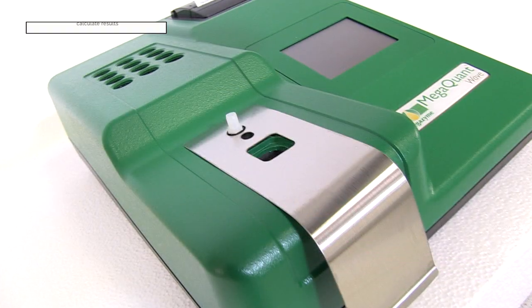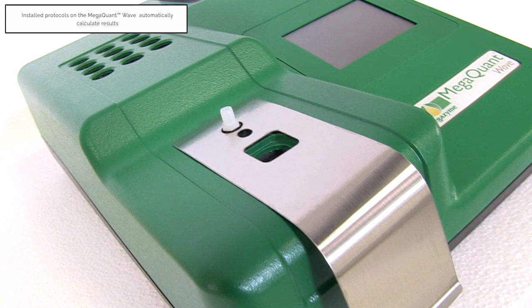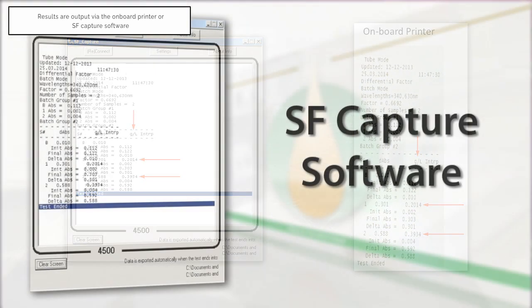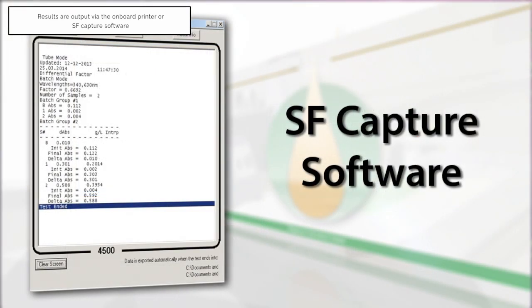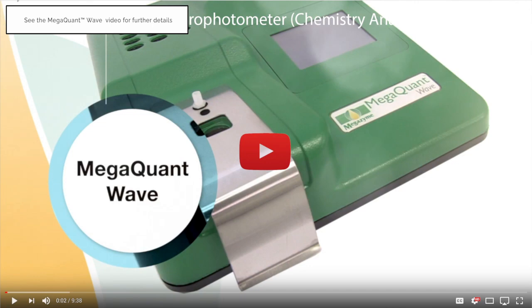When performing this test using the pre-installed protocol on the MegaQuant wave spectrophotometer, the results will be automatically calculated and printed via the onboard printer. Or the data can be exported to a computer using the SFCapture software. Please see our MegaQuant wave video for further details.